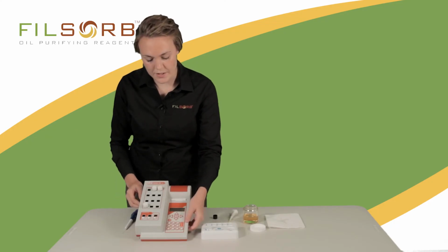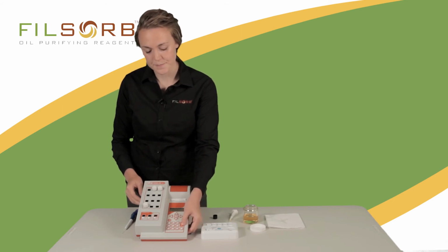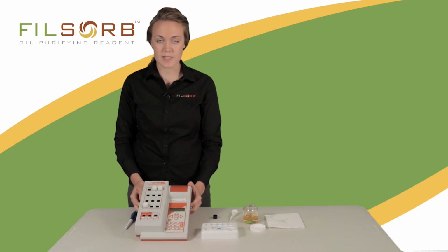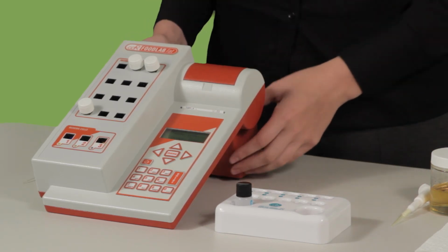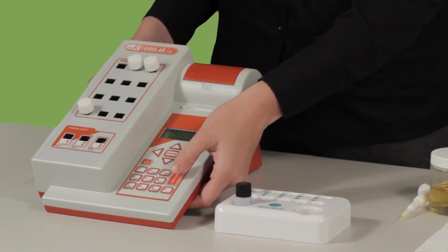You are now ready to start your incubation period. Start your incubation period by pressing enter. A timer will start, and when 3 minutes is up, a buzzer will go off. Once the timer indicates that the incubation period is over, you will press the enter key.